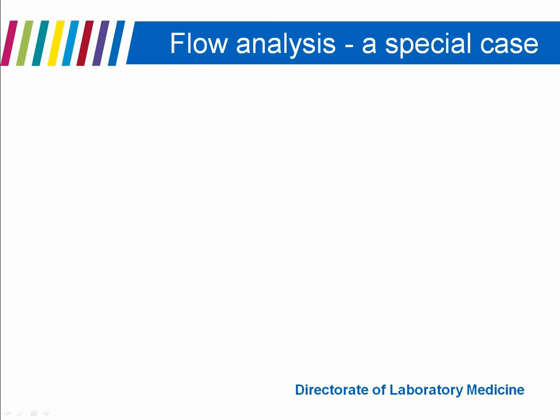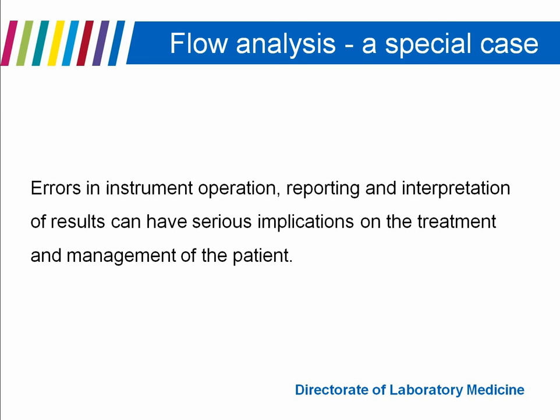And in part we can do this by ensuring our staff are adequately trained and fully competency assessed. CNST, the NHS Litigation Authority and the Care Quality Commission will all look at whether we can competency assess our staff properly if our trusts ever come under an inspection.